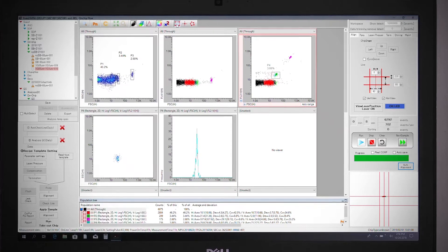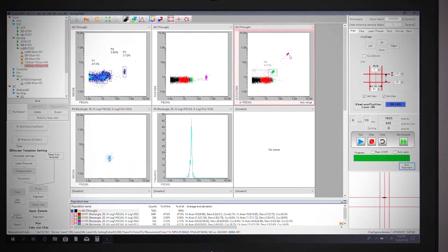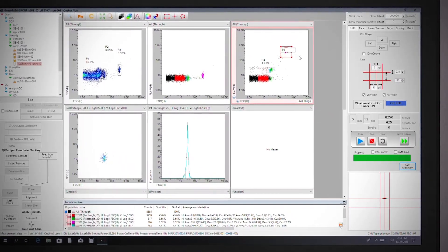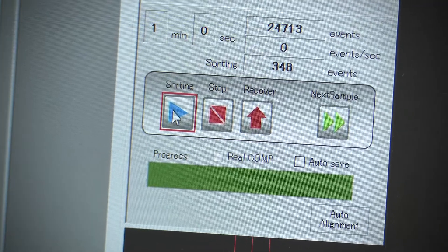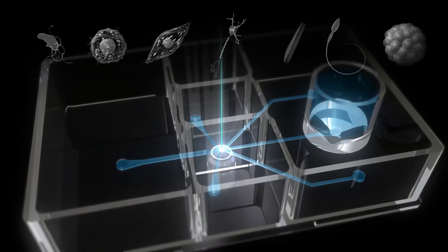Draw a sorting gate on the software, then press the start button to run the sample.